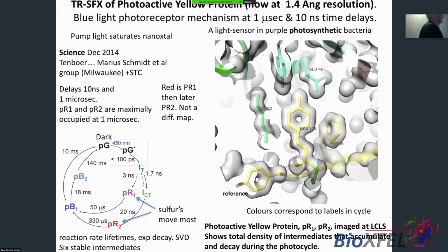But I think the important point, before I start this and show it to you, just let me say the colors over here correspond to the colors in the diagram here, which shows the reaction path. It's a cycle. But what we're imaging here is really chemical kinetics. These are images of kinetics. That is to say, the total amount of species as a function of time. We don't actually see the molecule jumping from one structure to another.